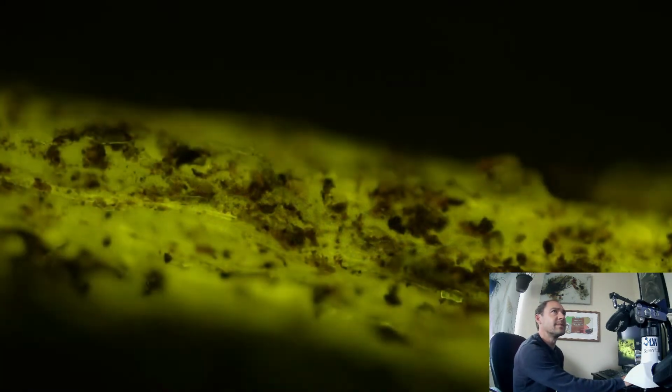And let's scroll on through. Right there in the middle, I think I see some fungi. So this is outside of my garden bed, so this is inoculated with mycorrhizae. Let's actually go all the way into 400 and see if I can get what I was seeing right on the screen here.